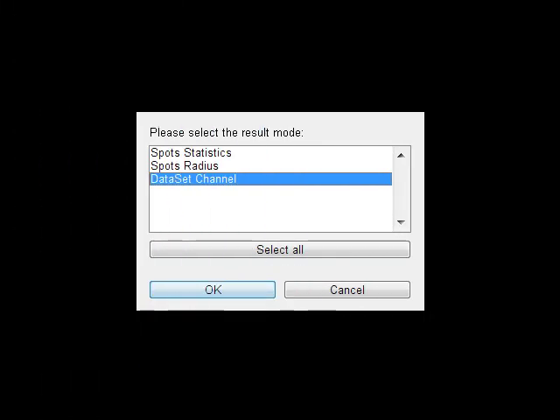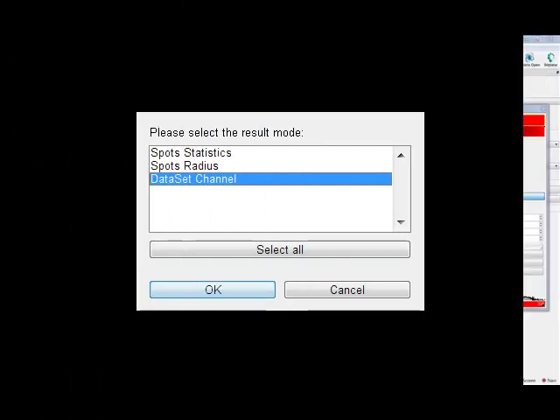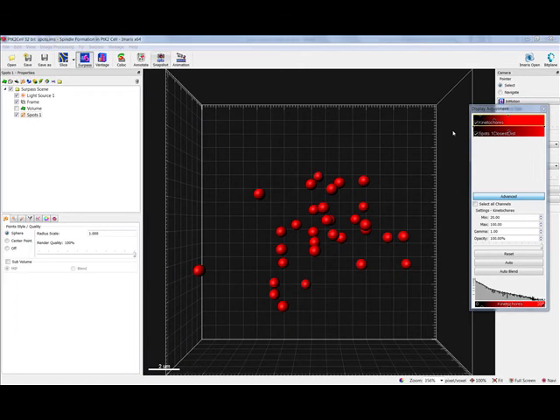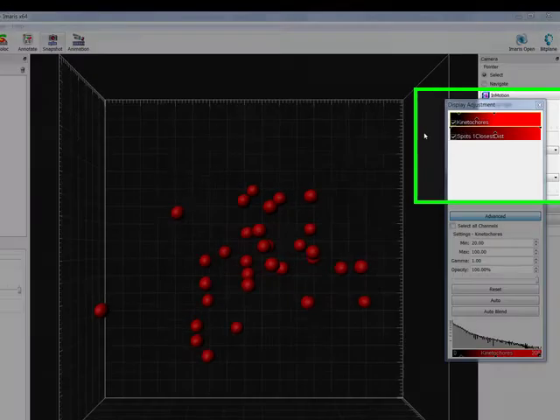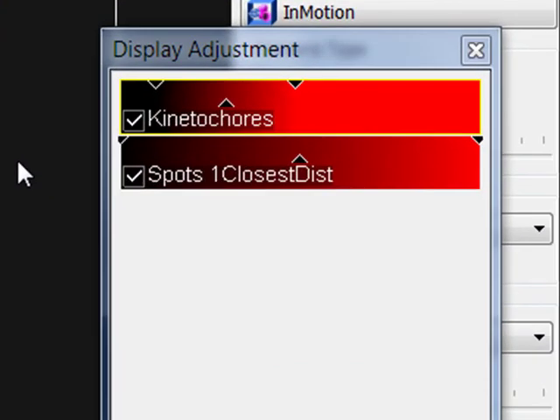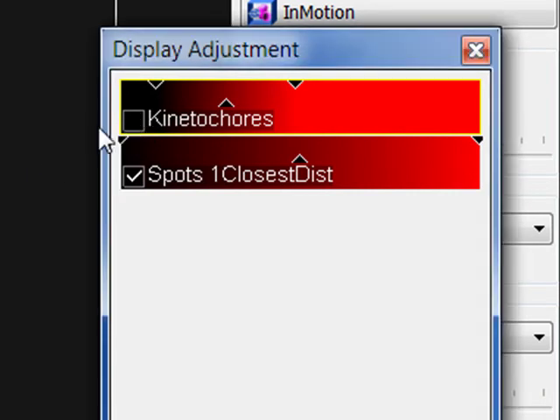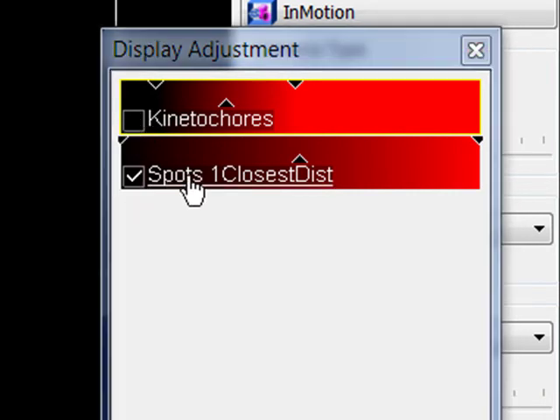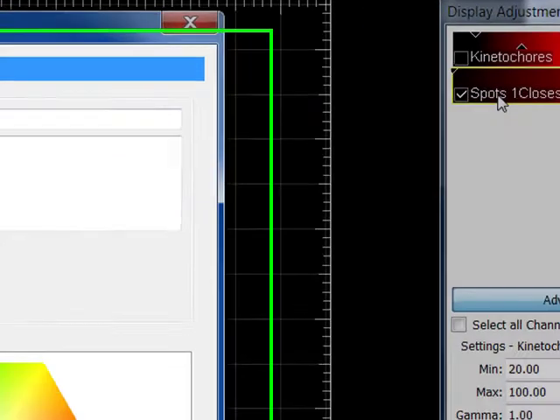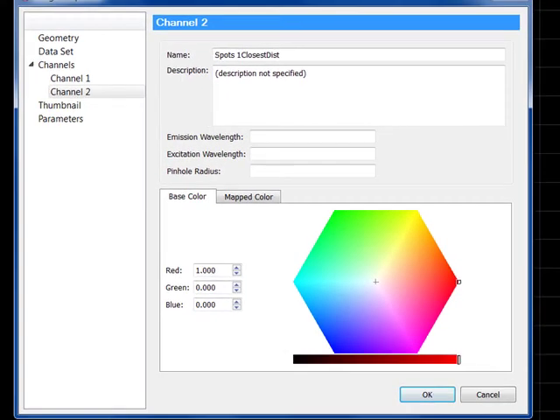Lastly, if you select the Dataset channel option, the distance values are encoded in the newly created channel intensities. A new channel has been added to the Display adjustment window. This new channel can also be used in visualization if its range is exaggerated and the color and gamma value is adjusted.